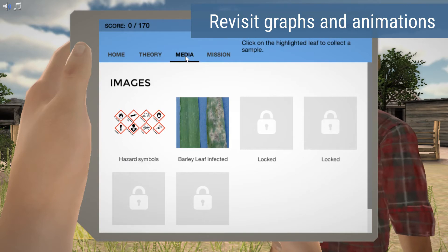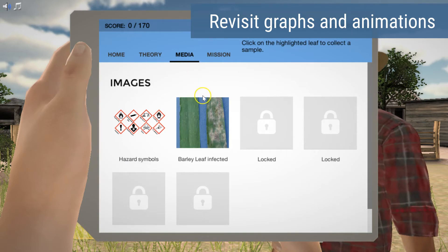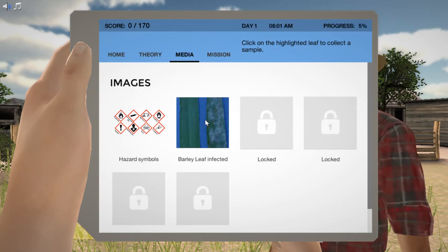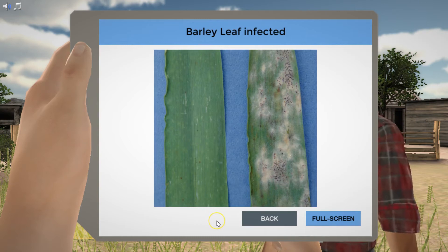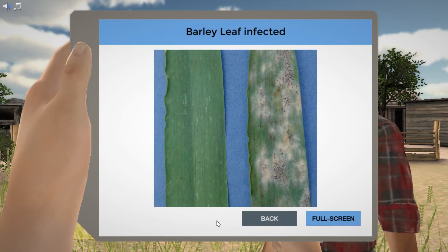With the media player, you can even see the animations, graphs, and collected data as many times as you want during the simulation, as well as at a later time for your exam preparation.